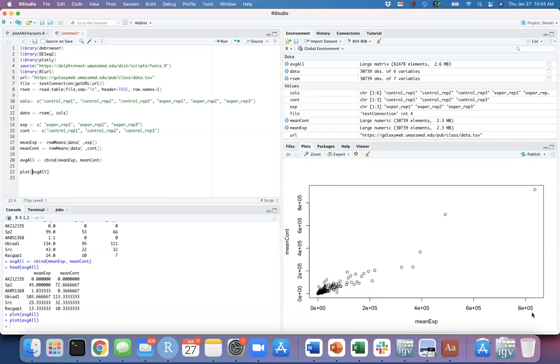So how you can do it, look, for example, this gene has 800,000 reads, and most of the genes are in this area, and you cannot see them like that. But when you take the log 10 of this 800,000, for example, the log of this will be, I don't know, 5.